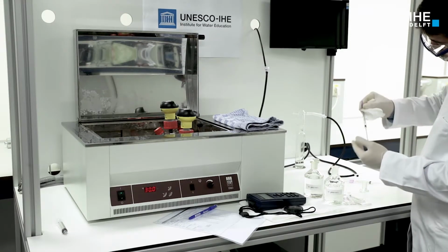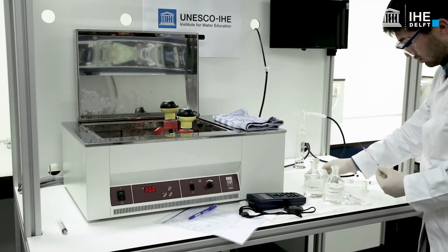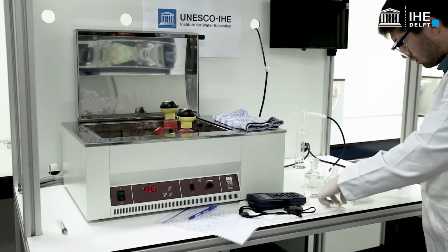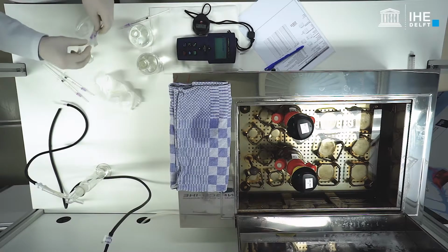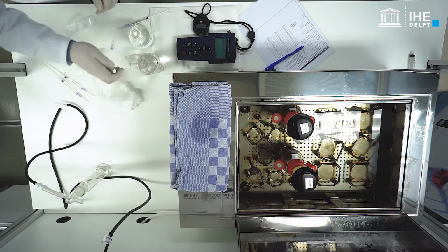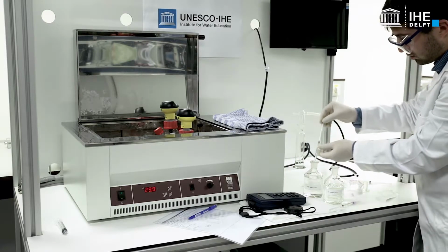Remove any air bubbles from the syringe. Repeat the procedure for the second stock solution.